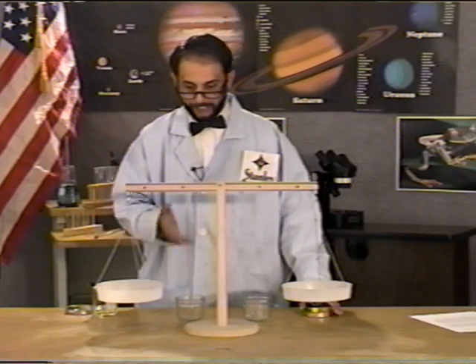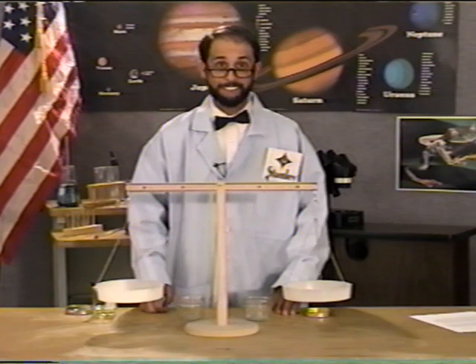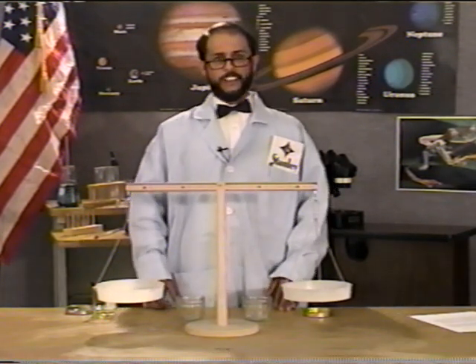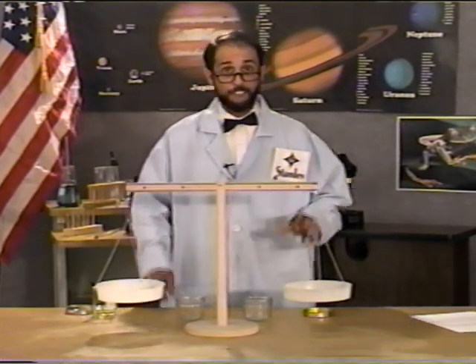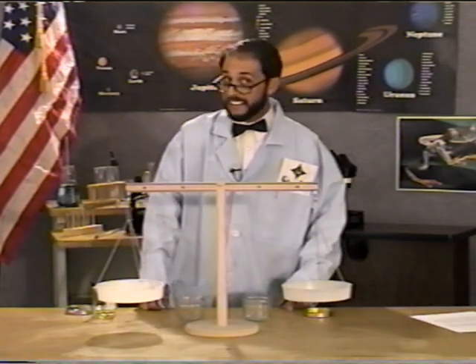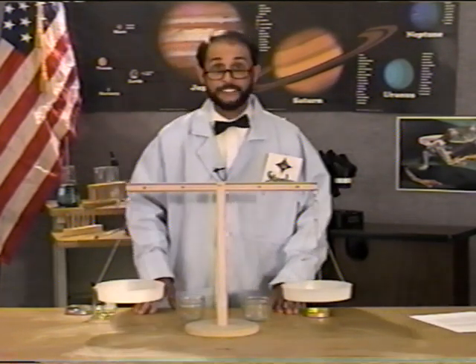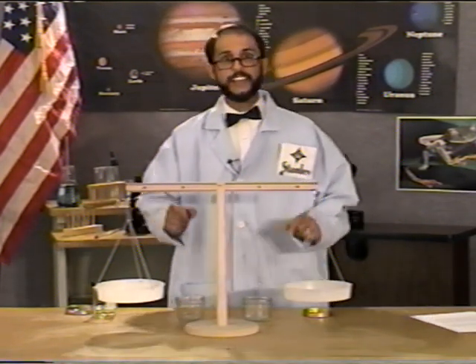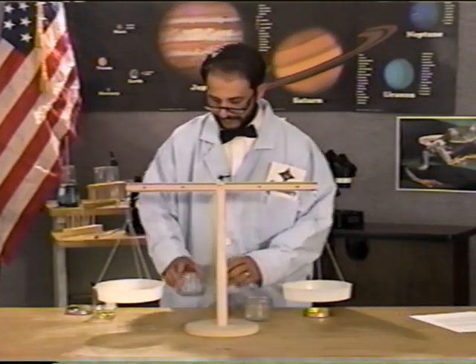Hi, here we're going to talk about a simple scientific law known as the conservation of matter. This says that matter can neither be created nor destroyed. We can determine whether or not there's been the creation or elimination of matter by weighing what we start with and what we end up with after a chemical or physical change has occurred. When you weigh something in this manner, you're in effect measuring its mass. In front of me is an equal arm balance. This will keep track of the amount of water we have here and tell us if anything's been eliminated at the end of it all.